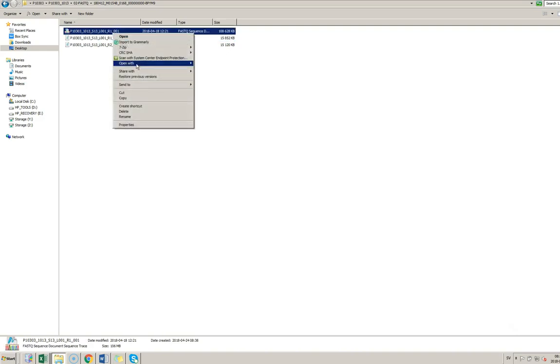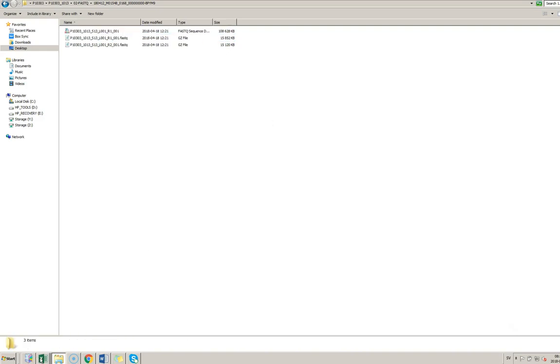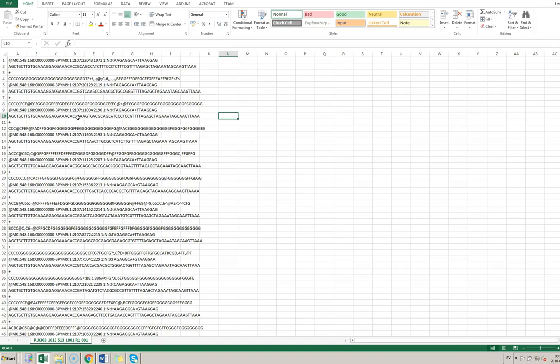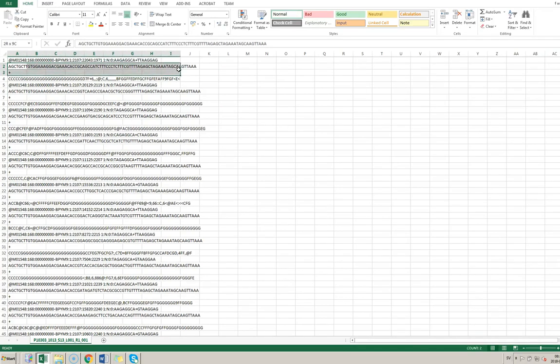If you unzip your GZ file and open the FASTQ with Excel, you'll get something looking like this — an enormous file containing a name, the actual read, and the quality of the read. You can read up on how the FASTQ format is structured if you're interested, but what we want to do here is try to extract the sequence from this.